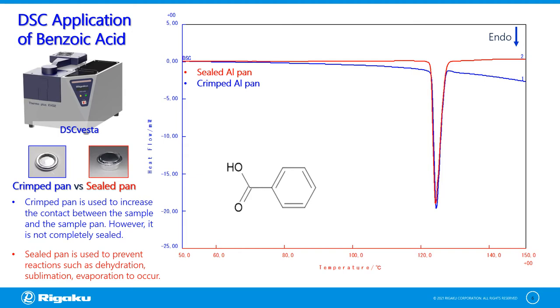Here is a DSC application of benzoic acid using a crimped aluminum pan shown in the blue curve and a sealed aluminum pan shown in the red curve. Benzoic acid is used in food and pharmaceuticals as an active ingredient for antimicrobial and antifungal preservative. It is a subliming material, which means the material changes from solid to gas phase. The crimped aluminum pan reveals a baseline shift towards the endothermic direction from 100°C due to sublimation, followed by another endothermic peak at 120°C due to melting. After the melting reaction, the DSC signal did not return to the baseline and continues towards the endothermic direction due to evaporation.